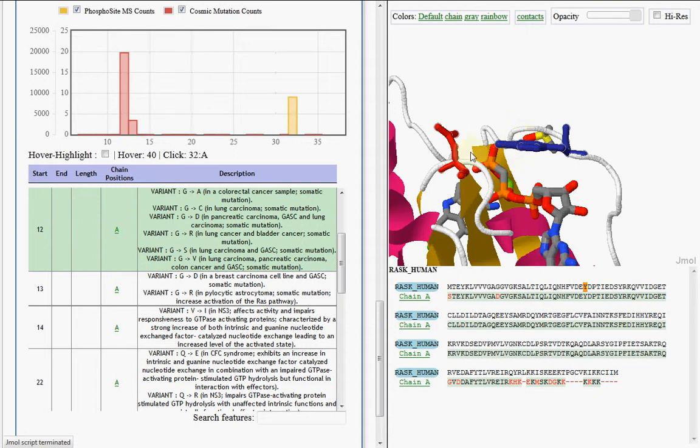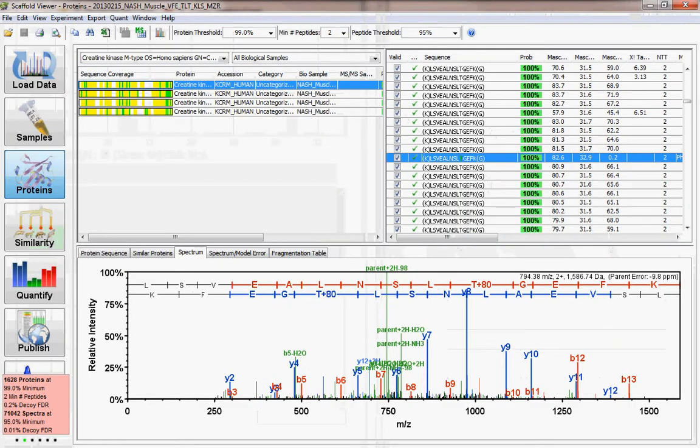But what I really designed AMASS for, and the reason it's been given the name AMASS, is because my lab at the Mayo Clinic uses mass spectrometry to study human diseases. Specifically, we analyze human tissues such as muscle and liver, and diseases such as type 2 diabetes and obesity and metabolic disorders. And using mass spectrometry, as you may know, we can literally break apart proteins down to their single amino acid levels by literally blowing them apart in mass spectrometers. And by measuring the distances between the peaks, we can determine the underlying sequence, as well as modifications that occur to single sites that occur in the cell.